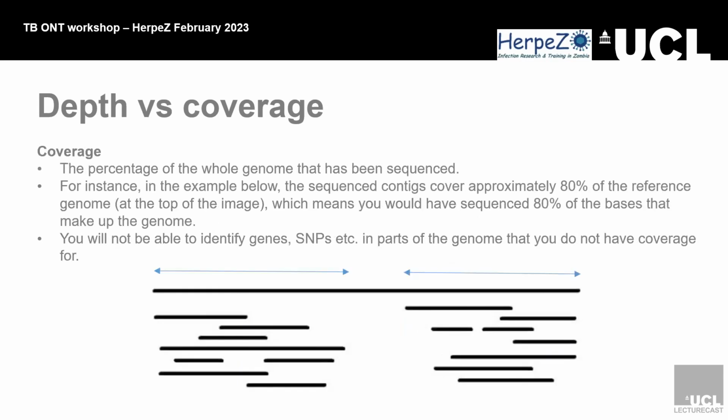And then coverage is just how much of the sequence you got. Once you finish running your experiments and you've got your different fragments aligned to the reference sequence, how much of that reference sequence have you covered? That's basically the coverage. Once you align your sequence you get a reading of either 97% or 98%, and you have gaps in your sequence showing where you didn't get enough information at those positions.